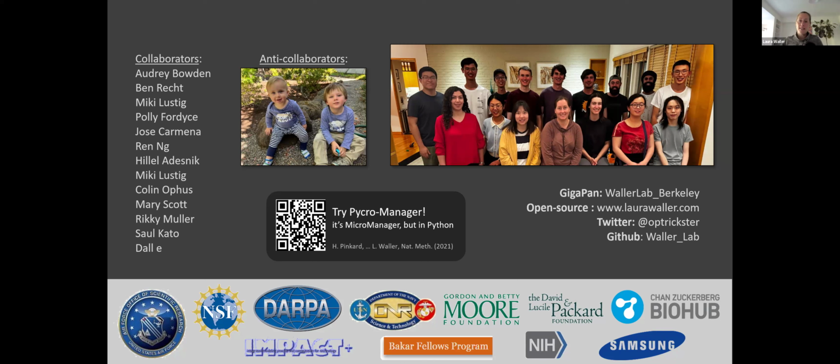Like the LED array stuff we've been working on for a very long time. We've designed, so this is our startup company, sells these LED arrays, and they have little adapters that can click into your condenser unit. So very easy to get that up and running. You do need to calibrate the LEDs. So if you say it's at 45 degrees, it better be actually at 45 degrees.